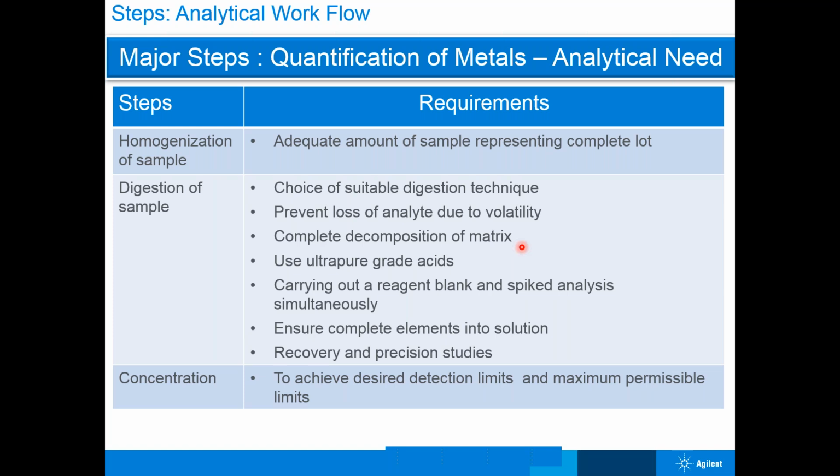So we will digest it. We will decompose the organic matrix by using suitable mineral acids. Those mineral acids are nitric acid, hydrochloric acid, might be hydrogen peroxide, and sometimes hydrofluoric acid. So by using the digestion technique, we will do the complete decomposition of the matrix.